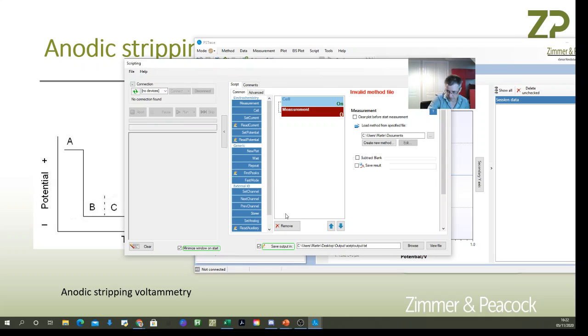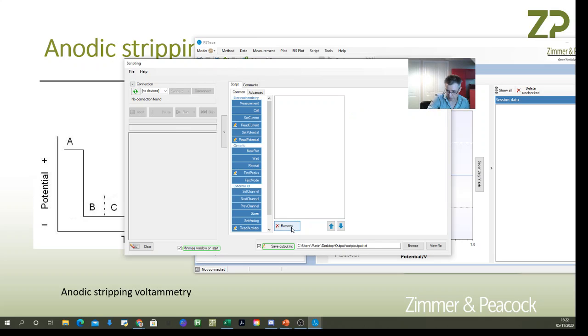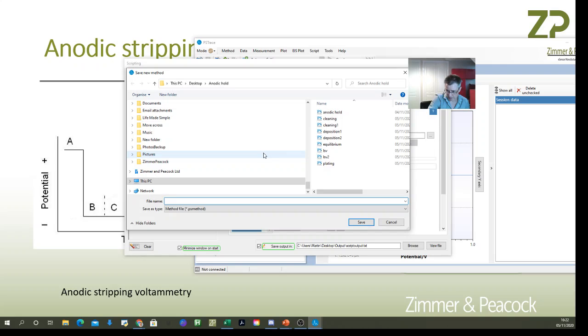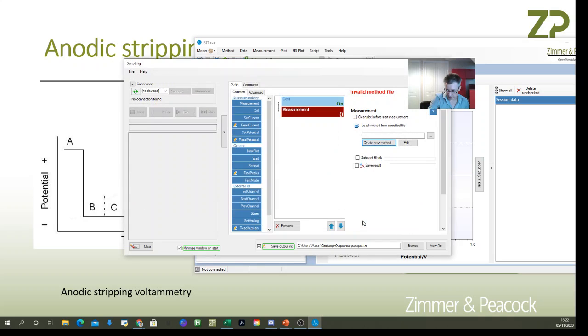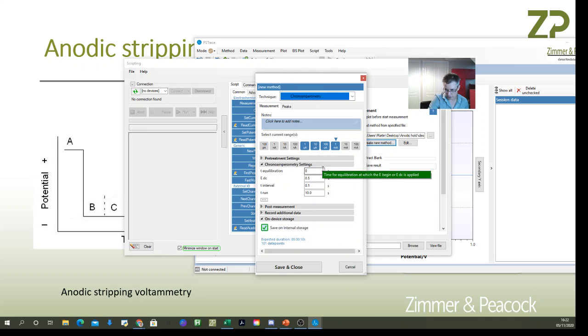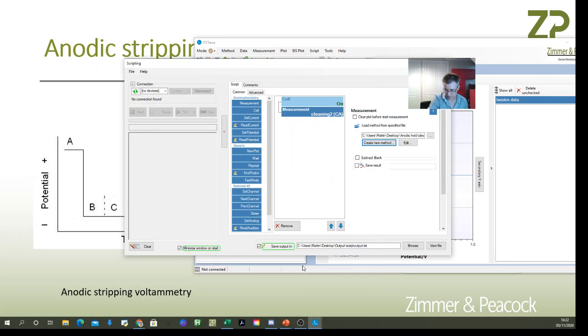I open the scripting interface. The first thing I want to do is turn the cell on — this means turning the electrodes on. Next I create a cleaning step using chronoamperometry, applying one volt with a save rate of one second for 60 seconds. That's the cleaning step added.